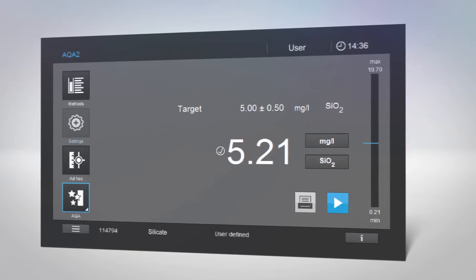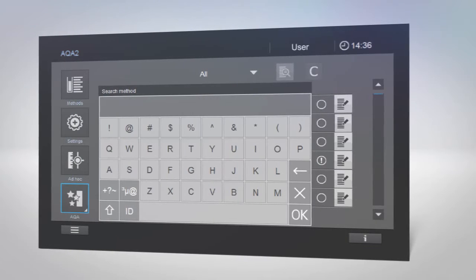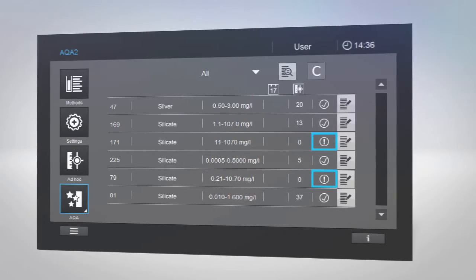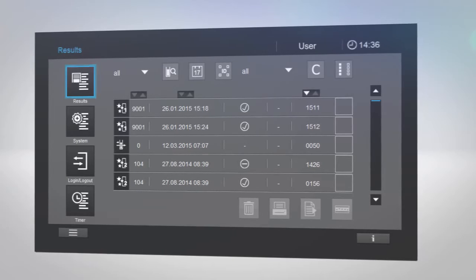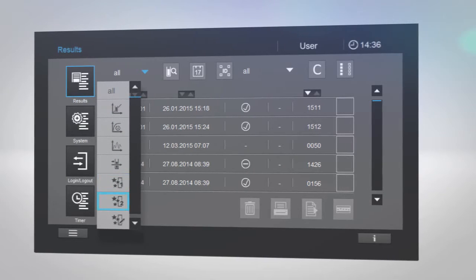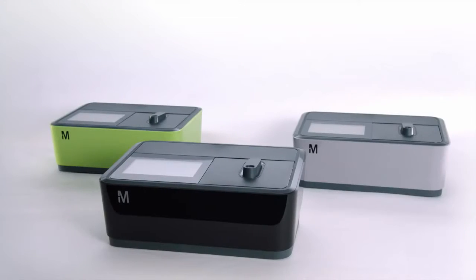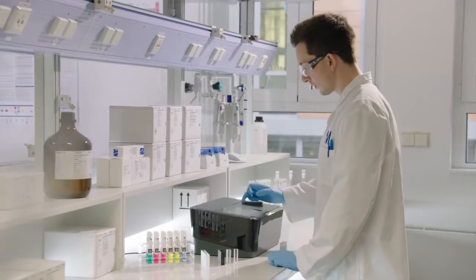To check the status of an AQA for a specific method, go to the AQA menu and select AQA2. Using the name search, enter the name of the method. If the AQA for this method has expired, you will see an exclamation mark. All AQA measurements can be accessed in the results list, where you can select AQA1 or AQA2. To see the protocol of a specific AQA, simply tap your desired method in the list. All CRM standards and combi-check solutions offered for AQA tests are pre-programmed on SpectraQuant Prove. The instrument supports and guides you through each test to ensure the security of your analytical results.